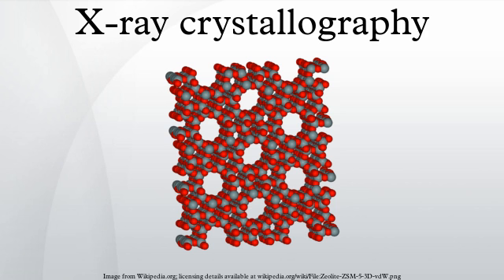The net radiation arriving at the screen is the sum of all the scattered waves throughout the crystal, which may be written as a Fourier transform, where q equals k_out minus k_in. The measured intensity of the reflection will be the square of this amplitude.